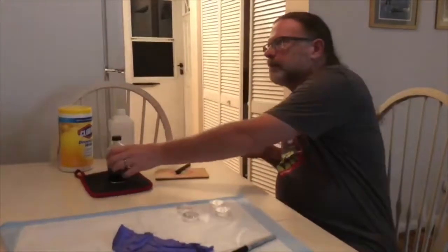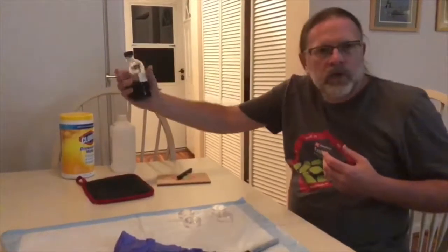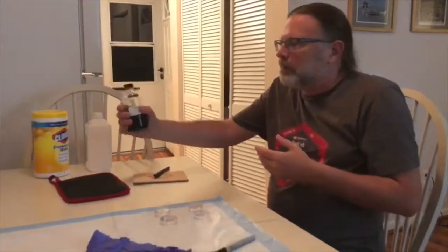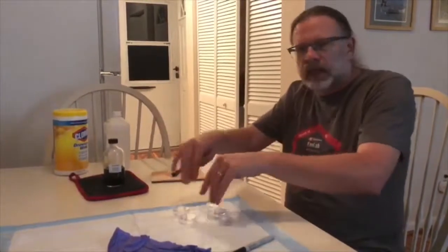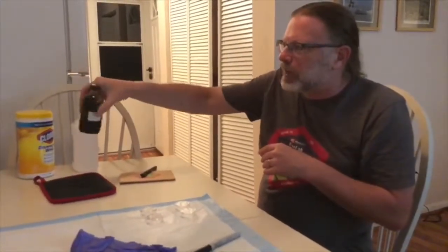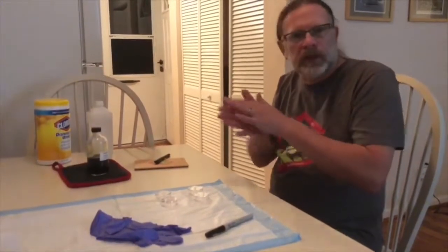My media has been heated in the microwave for about 2 minutes, so it's completely liquid. But I've let it cool to the point where instead of it being boiling hot, it's now just slightly warm to the touch. You want to let it come down to that temperature, because when we pour it into the plates, if it's too hot, we'll get a lot of condensation on the inside. Also, there's a nutrient in this media that precipitates out, so you want to swirl it periodically to keep everything in suspension. And I got my gloves, so I'm going to glove up, and we're going to do the first step, labeling the plates.